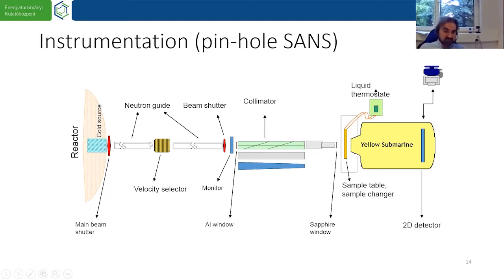So these white sections are neutron guides. Neutron guides are usually longer than this small piece, so this is only a schematic picture. They can be 10 meters long, 50 meters long, 100 meters long. They are very efficient because they allow us to transfer the neutron beam up to long distances without big losses. The losses are usually about 10% or 20% over the whole path.